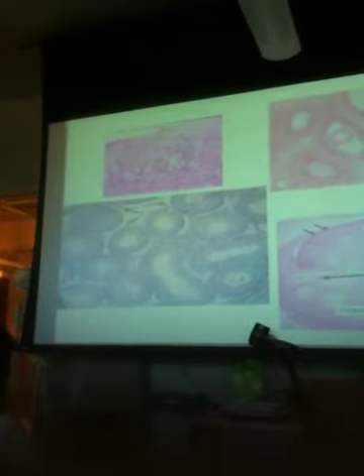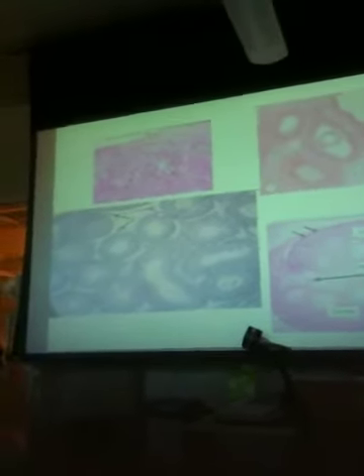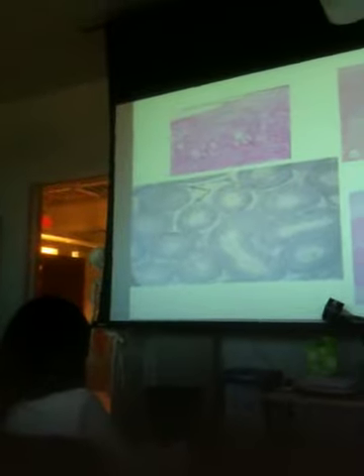Seminiferous tubules. What are the cells in between the seminiferous tubules? Cells of Leydig, or interstitial cells. Okay, so these are views of ovaries.